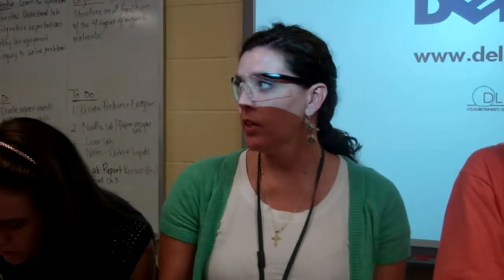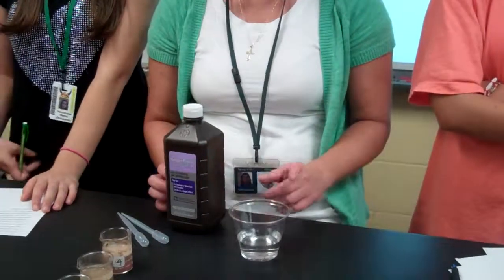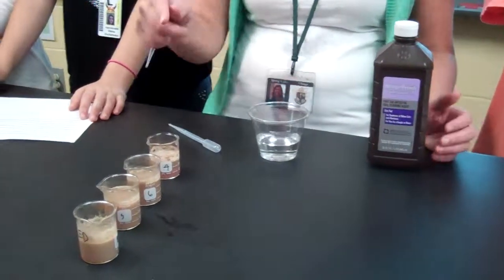Remember that this topic has to do with enzymes, right? So liver contains what? Enzymes. So your body has a liver, right? What does your liver have? Enzymes. So enzymes are really important for reactions in your body to occur, right? Okay, so what I have in here is the hydrogen peroxide that I just poured in. Again, hydrogen peroxide is H2O2. And so I want you to see what happens when I add hydrogen peroxide to each of these.